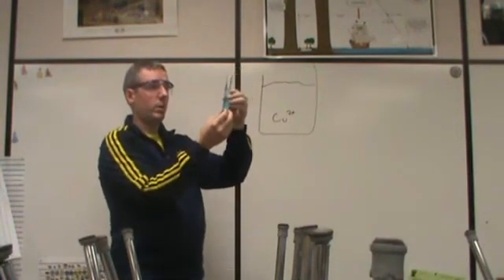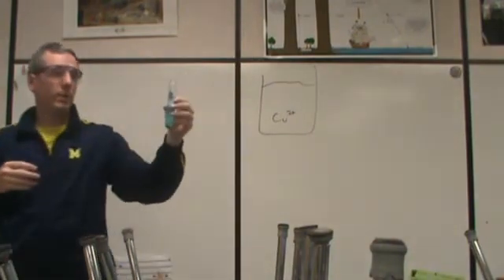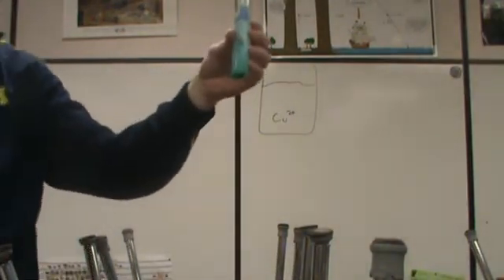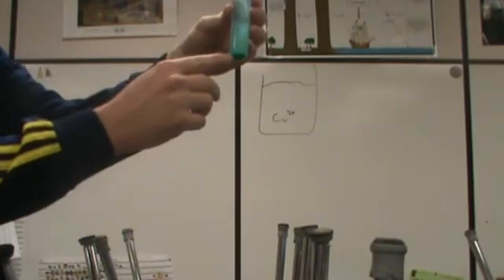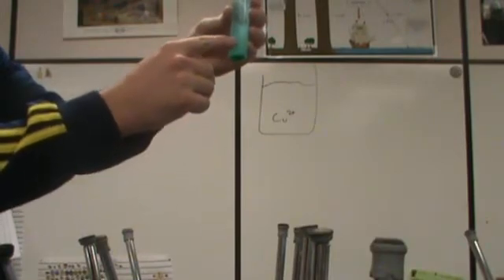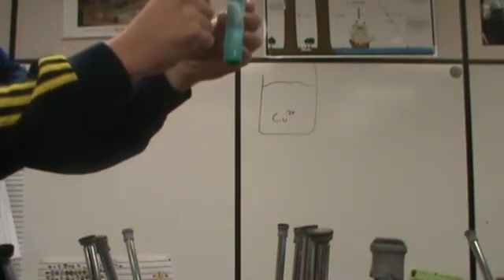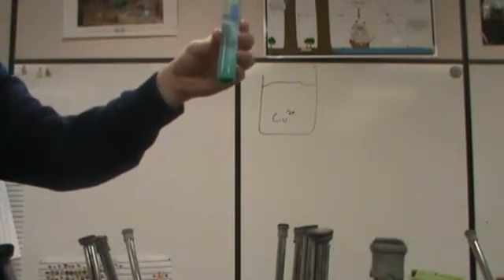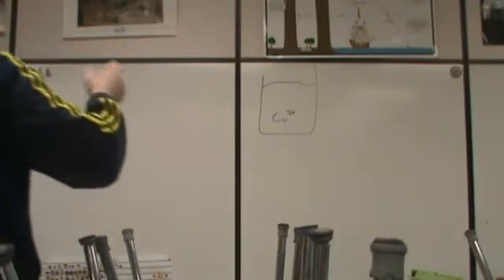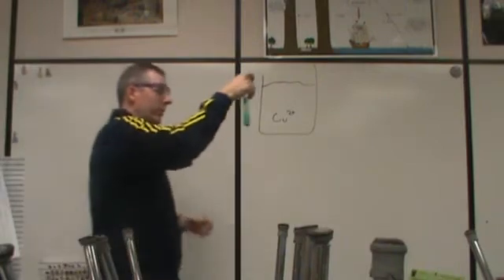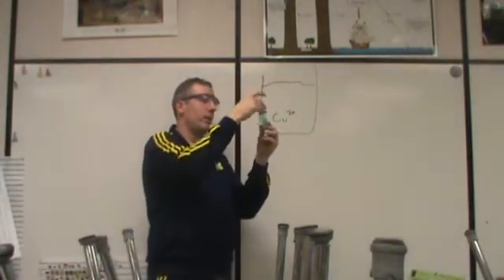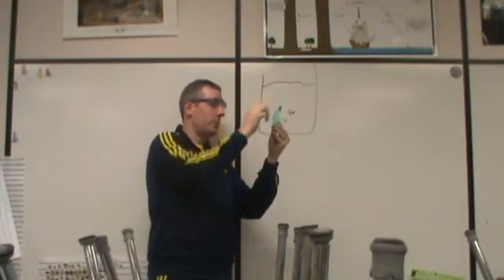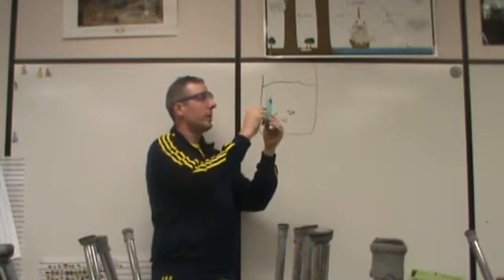Here I have a copper chloride solution. If I bring this a little close and hopefully this will zoom in at some point and you can get a nice accurate vision of this, you'll see some green here at the bottom, blue up here, and then you'll even see a little bit of green here. So the copper chloride itself is green in certain instances, but you can also see that it's clearly blue here. So it's an interesting question: what's the difference between down here where I see the green and up here where I see the blue?